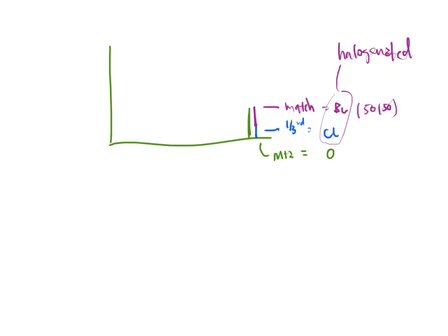Folks, we're back and we're going to talk more about some of the information that we can get from a mass spectrum. Notice that we haven't done a full-blown analysis of a mass spectrum yet. I'm just picking out little pieces and parts that we're going to eventually put all together at the very end. So in the previous video, we talked about the idea of an isotope and why M+1 peaks show up and why M+2 peaks show up.